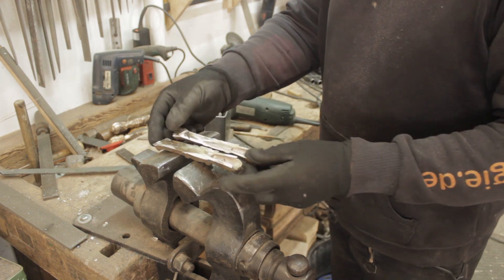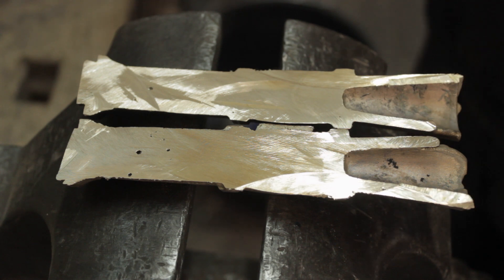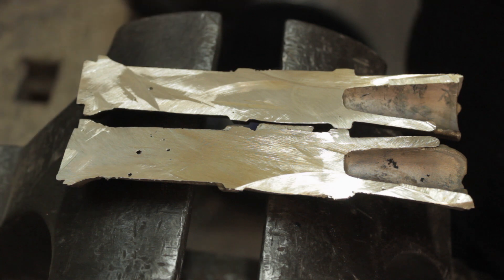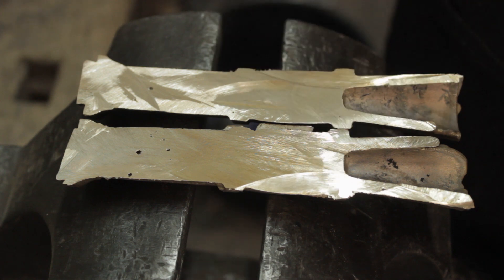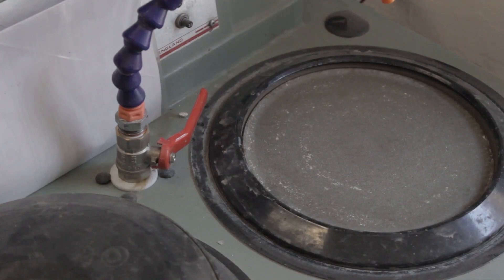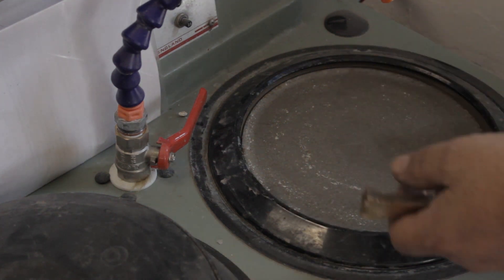Let's have a look at how well I have done with the casting. This is a perfect example of why you always have to be careful when dealing with cast objects, especially if you intend to use them as firearms. We can see a few casting defects and we'll have to decide whether these are problematic or not. Let's head over to the prep lab, give this section a proper grind and polish, and then we can see.